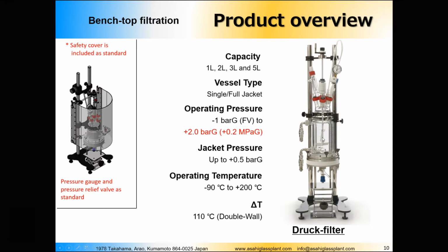I personally always recommend to buy a full jacket. The price difference is not that high, and when you need to, of course, you can do the filtration without heating or cooling in a full jacket unit. If you have only a single-walled vessel, you will need to buy another vessel for doing hot or cold filtration. So that's what I always recommend to the customer, to consider the possibility to purchase the full jacket vessel.